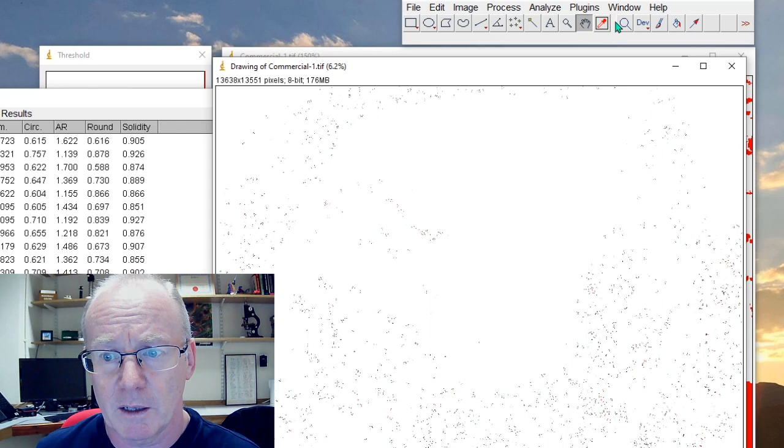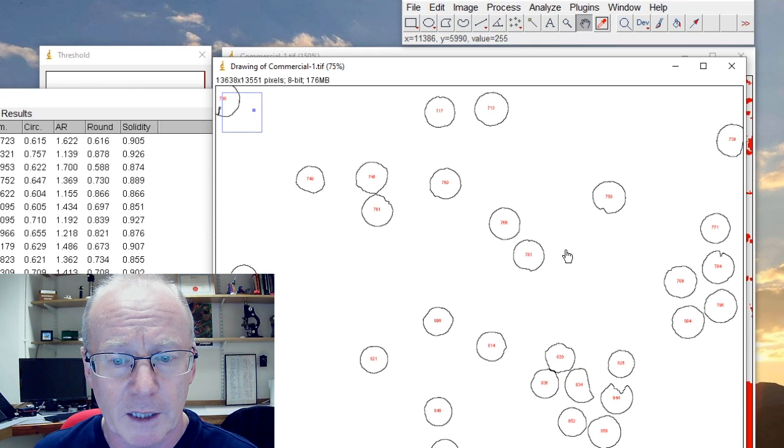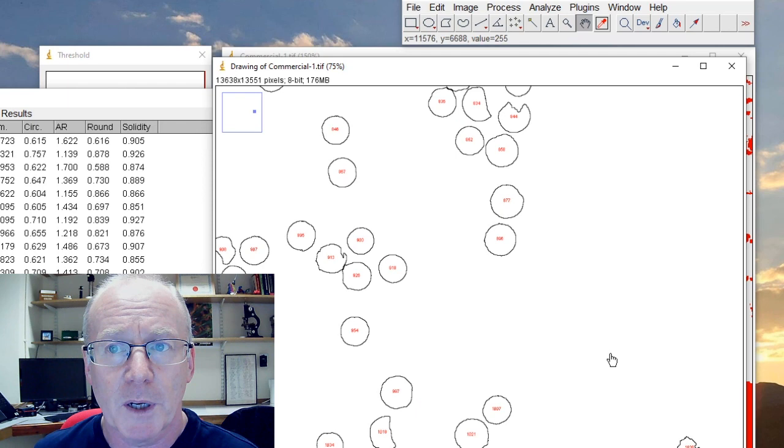Yeah so we've got a lot of stuff over here which isn't really to be included, but we can exclude them because they have numbers so we know which ones we don't want. But you can see quite nicely that it's pulled out all of these circular objects.